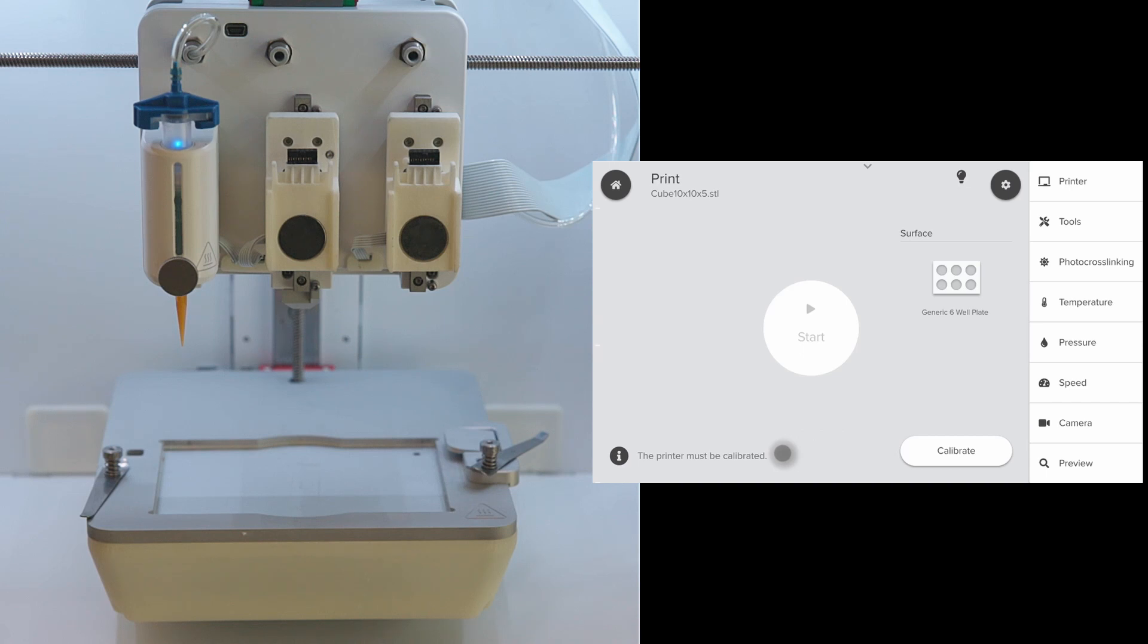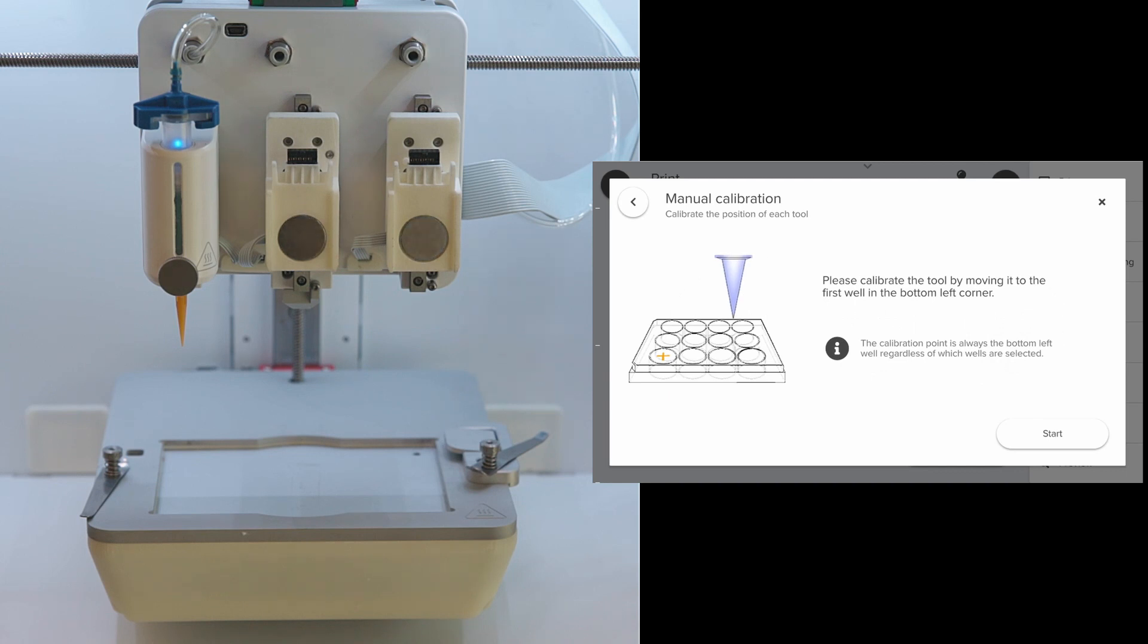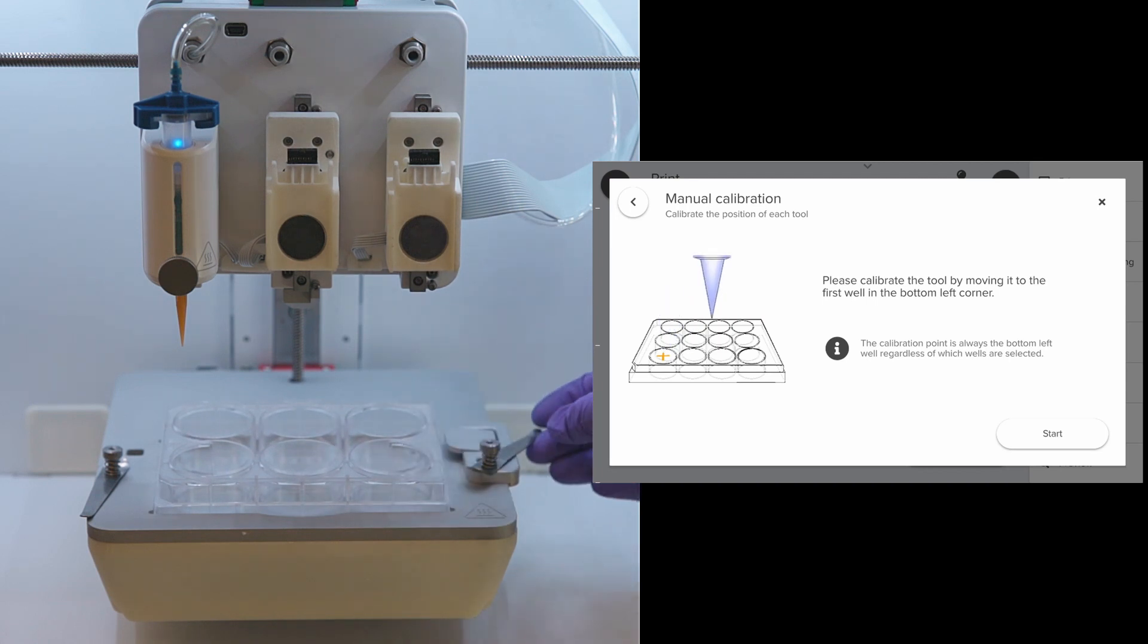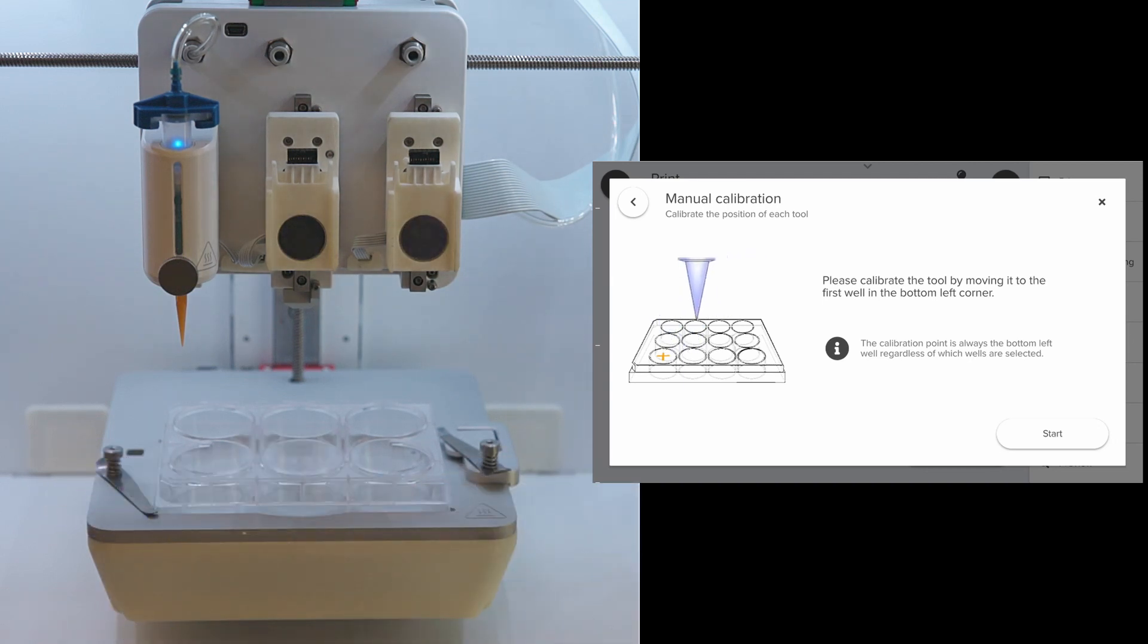Before we can start printing, we have an error message that the printer must be calibrated. To calibrate, click on calibrate and click on manual calibration. A figure is displayed showing how the calibration is to be done. We need to place the tip of the needle in the first well, which is the bottom left well of the multi-well plate. Place our 6-well plate on the print bed. We can use these metal flaps to hold the 6-well plate in place. Click start to manually calibrate the printer.